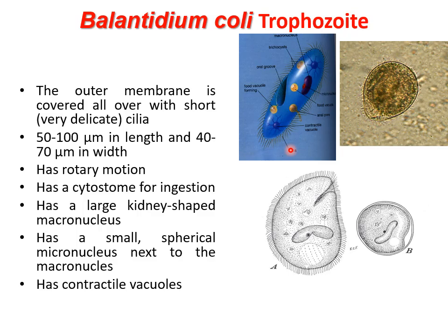If we go over the properties of the trophozoites, I want to explain first on the schematic representation. Basically, the trophozoite of Balantidium coli is big in size. It is surrounded by cilia that beat all over the surface. The trophozoite contains two contractile vacuoles that regulate the osmotic pressure. It has an oral groove to allow ingestion of food. Evacuation of waste happens by fusion of vacuoles to a certain area in the trophozoite called the anal pore or cytoproct, knowing that the oral groove is called the cytostome.